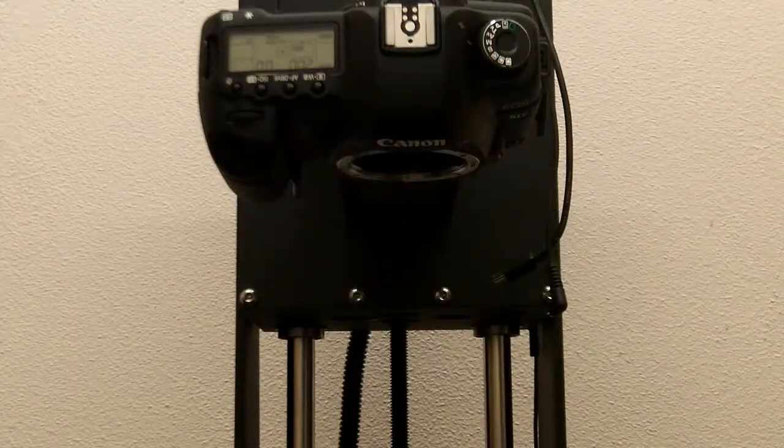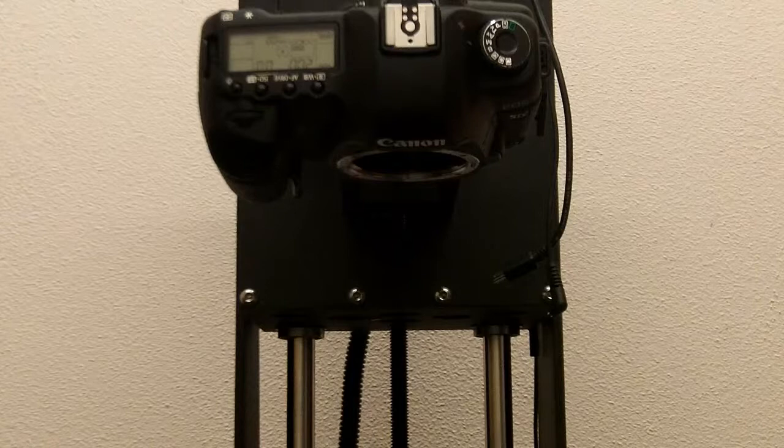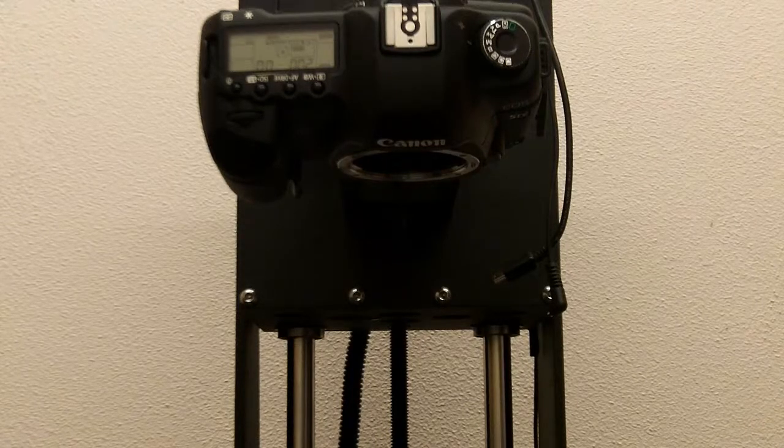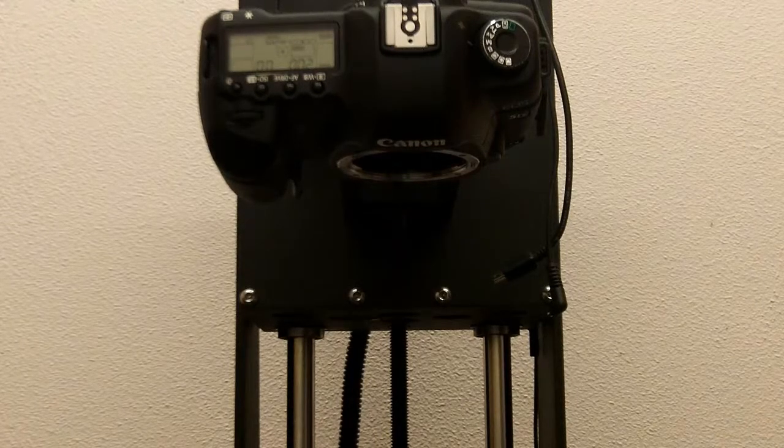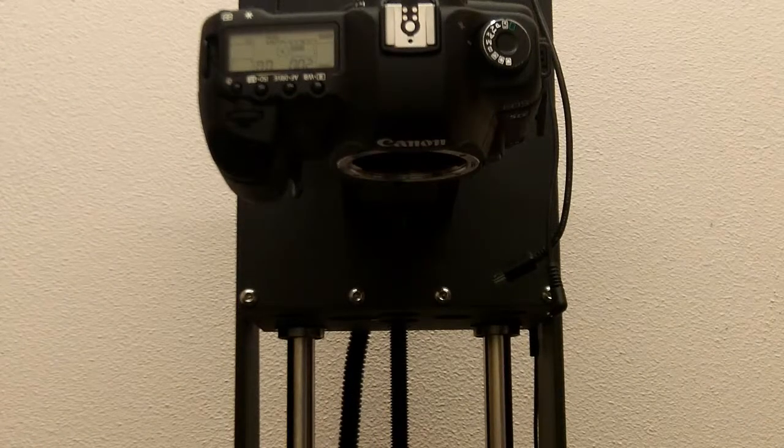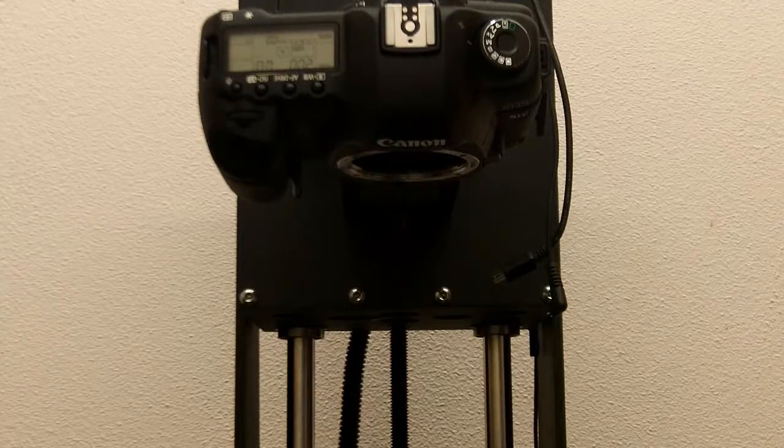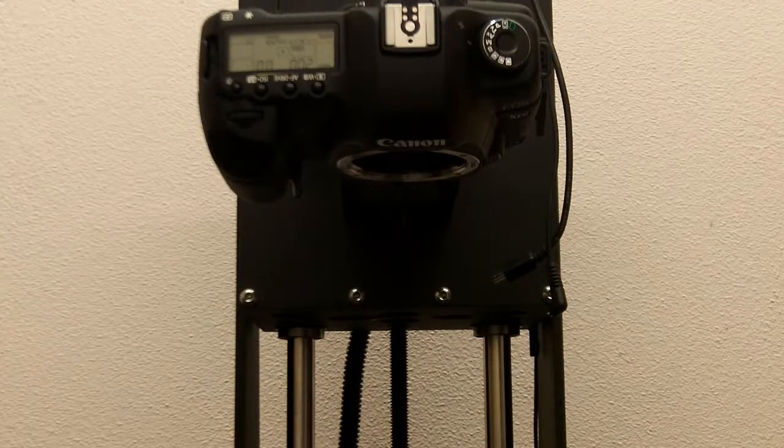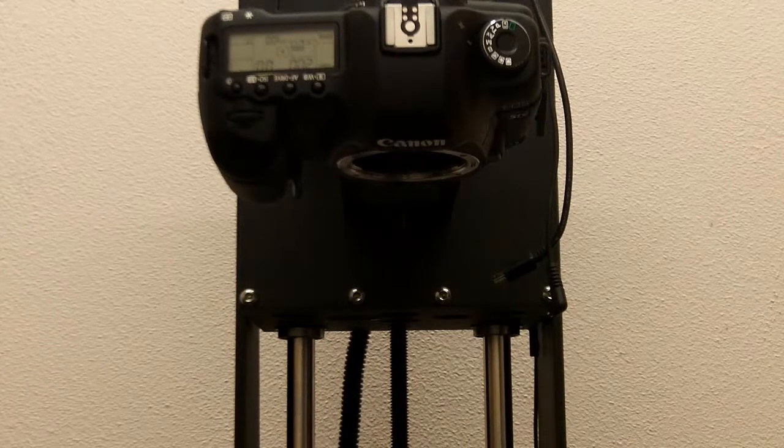So, the magnification process for the 50mm, as well as the 35mm, is very similar to the 100mm.